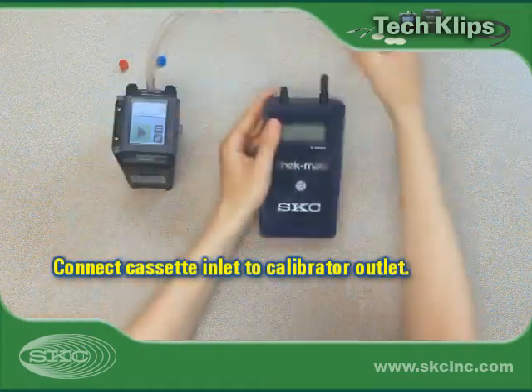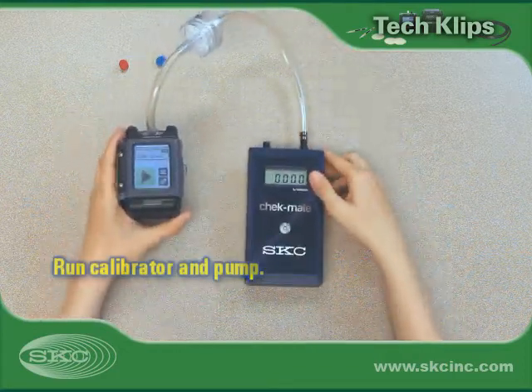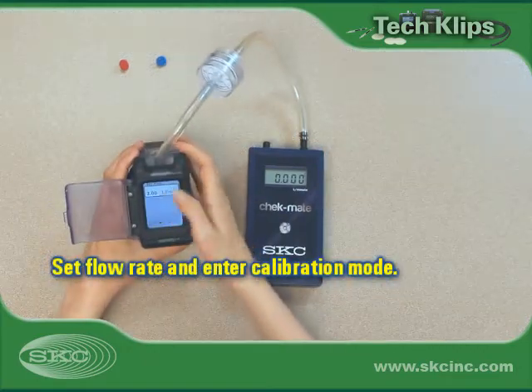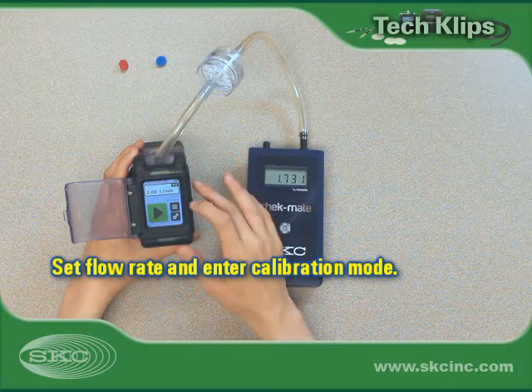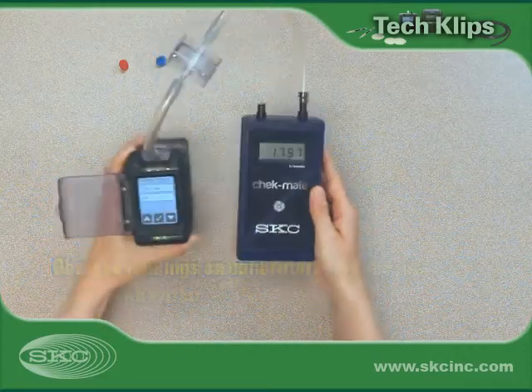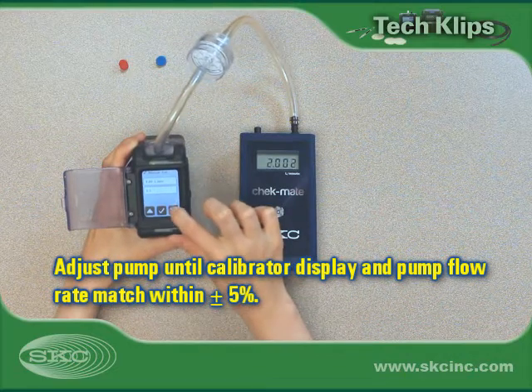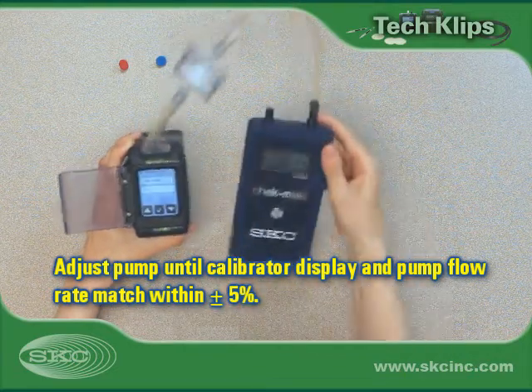Run the pump for 5 minutes and the calibrator according to manufacturer instructions. Set the method-specified flow rate on the pump and enter calibration mode — see pump operating instructions for more information. Observe the flow readings on the calibrator screen. Adjust pump flow calibration until the calibrator displays a consistent reading within 5% of the desired flow rate.